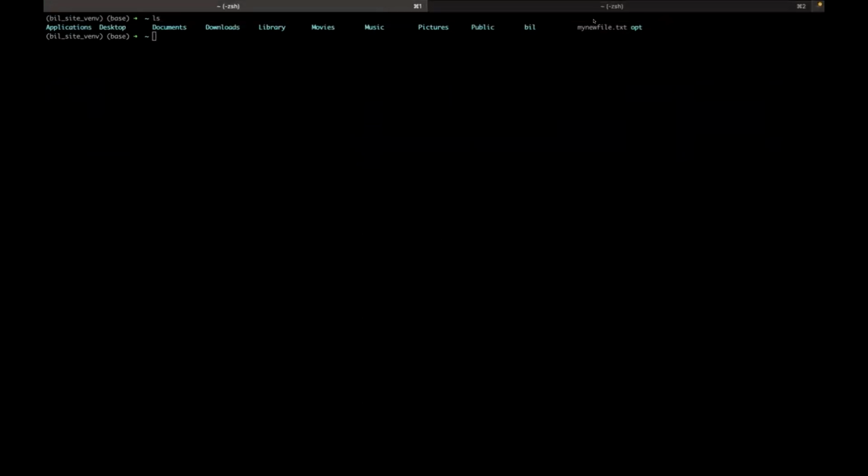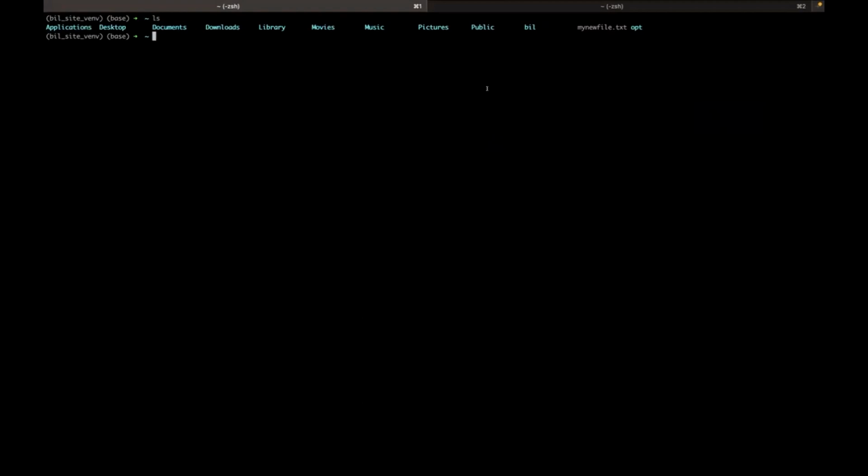So for me, since I have that file available right here, my new file, I'm going to do SCP, my new file, my username at upload.brainimagelibrary.org, colon, and then I'll put that directory that I created before here.